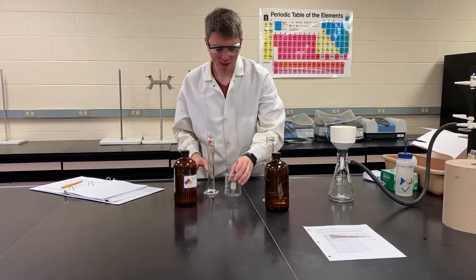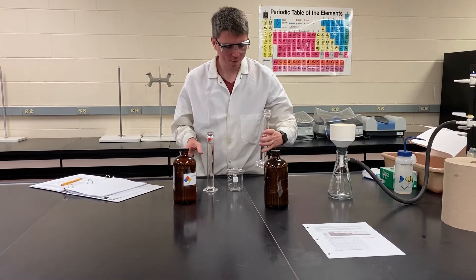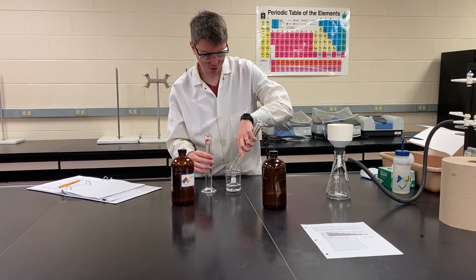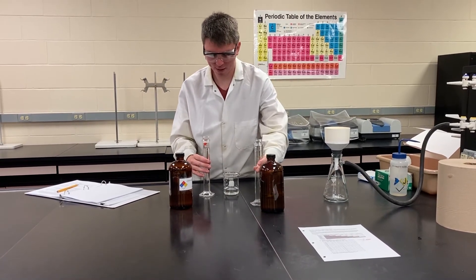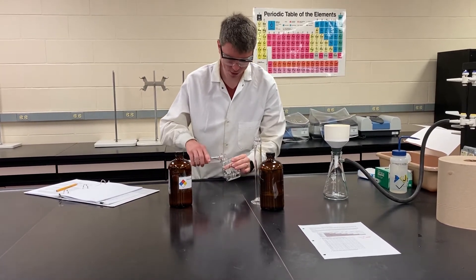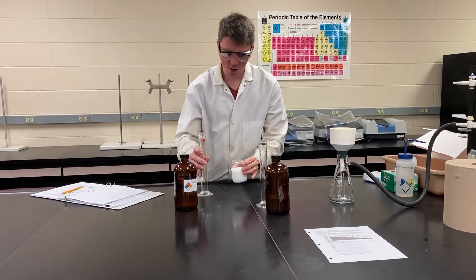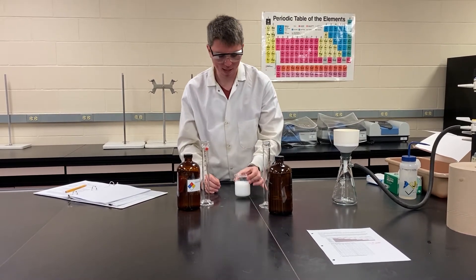Now that we've measured both of these out, we're going to mix them together. Hopefully we get a precipitation reaction, which is what we saw in the precipitation experiment. There it is — these two clear solutions have now made this cloudy white precipitate.